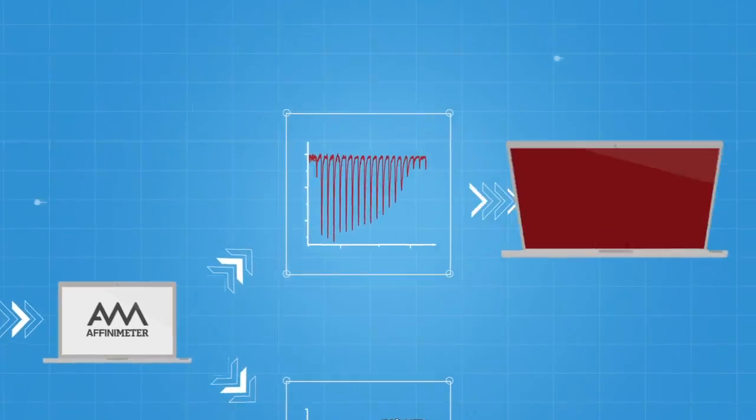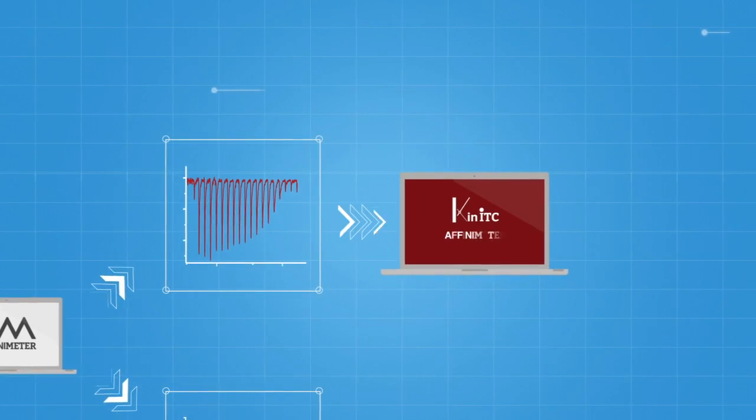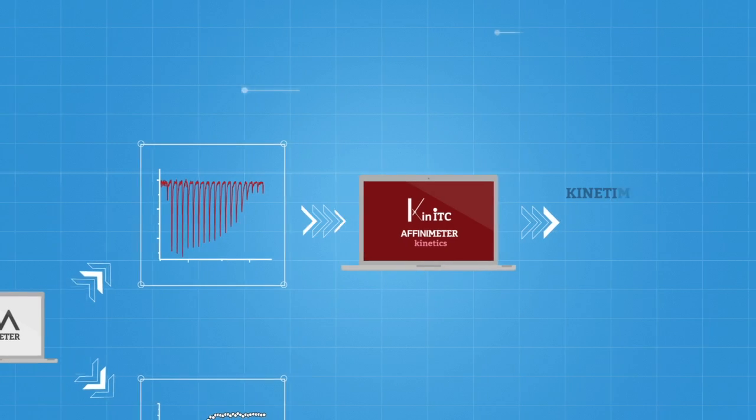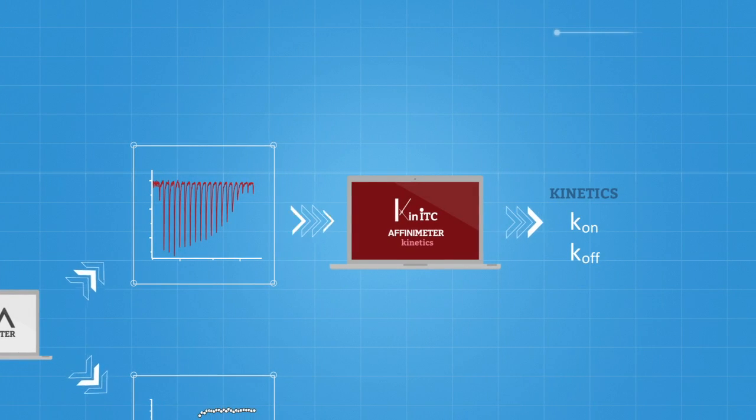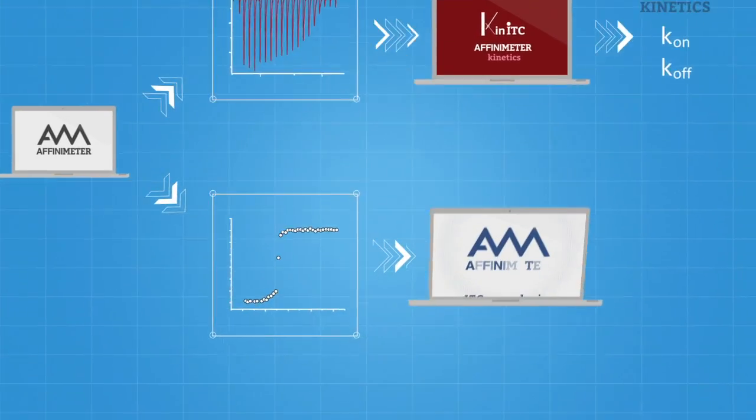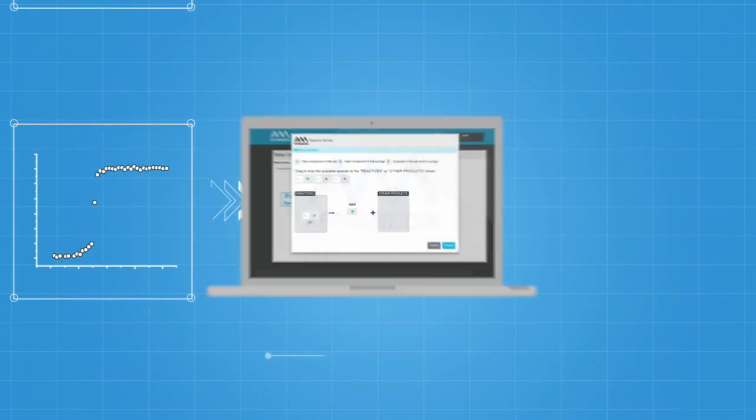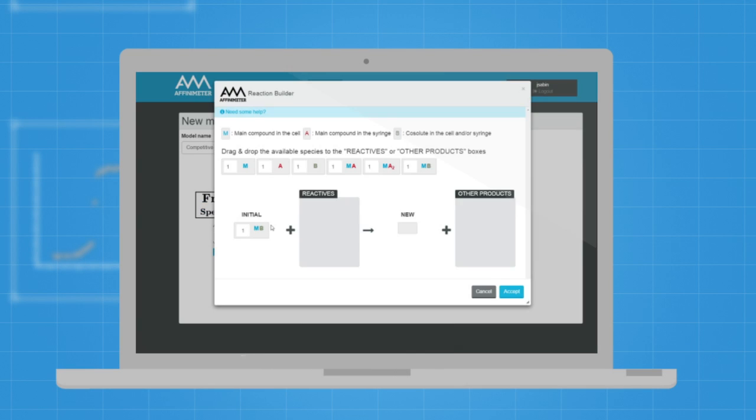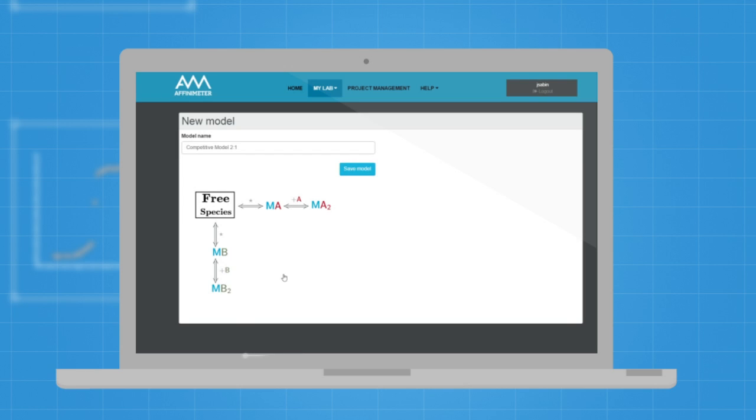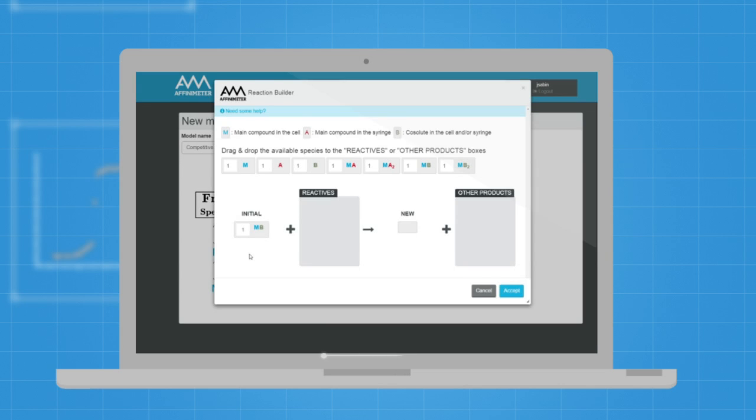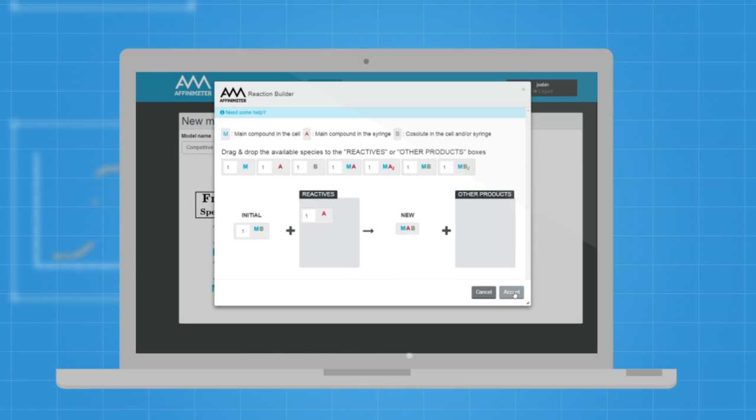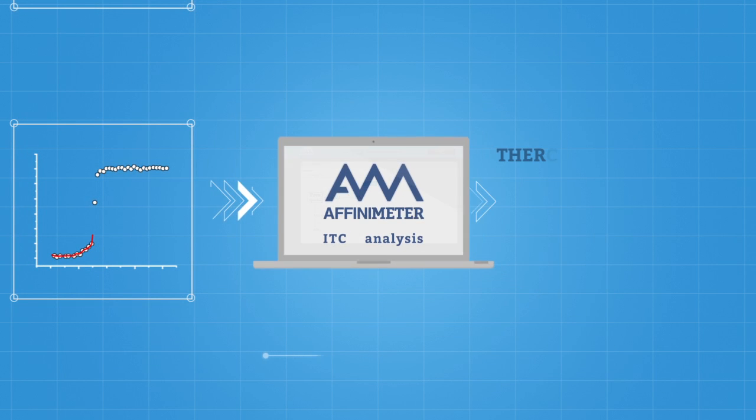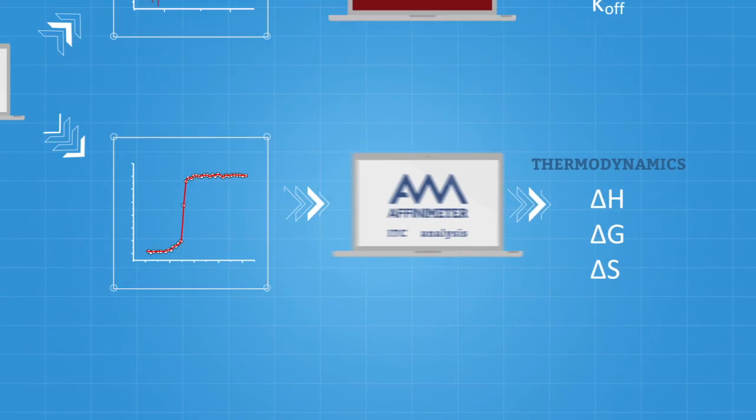Use our unique tool KinITC to extract kinetic information directly from the thermograms. Affinometer provides a collection of models to analyze isotherms of many different types of experiments. It also provides an easy to use tool to allow users to create original binding models. Not having the right binding model to describe a system will no longer be a reason not to analyze your isotherms.